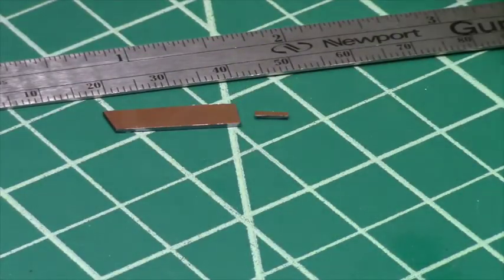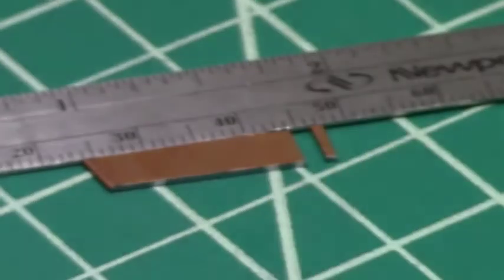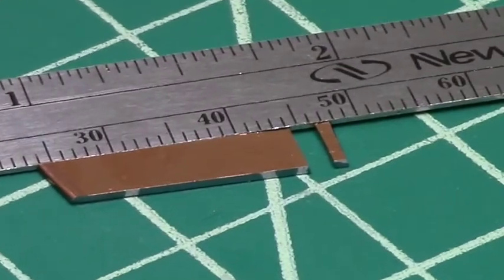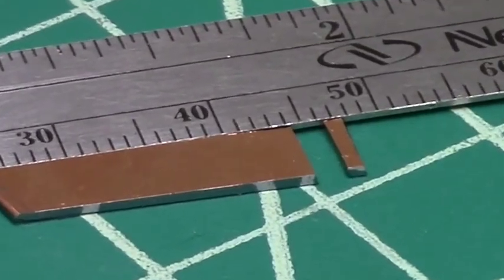In this case, the flip scribe was used to scribe across the entire width of the backside. This prevents any particles from getting on the front side of this thin film. The small sample pliers were used to cleave the sample.